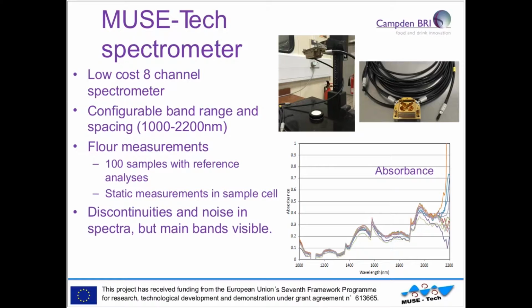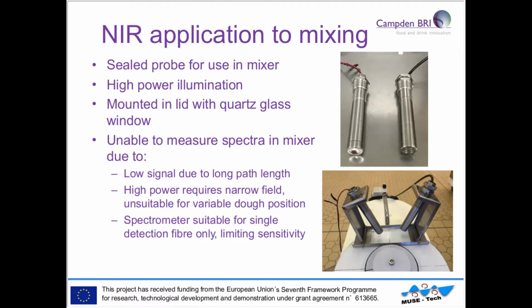There's also some noise towards the longer wavelengths, which is where the signal was fairly low and the spectrometer is less sensitive there. But we can still see the main bands that we had identified in the previous work, which gives us some confidence that we might be able to apply it to mixing.